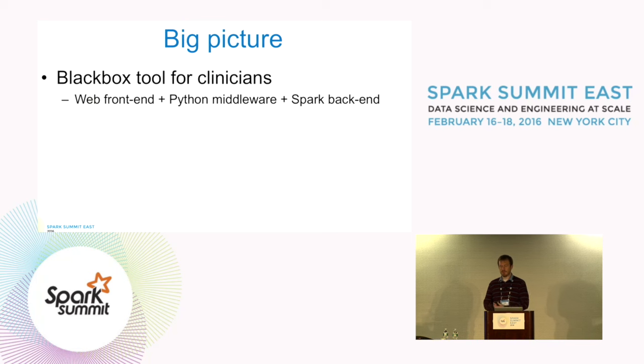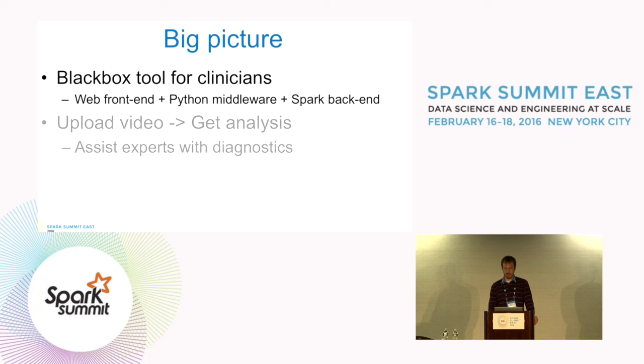And the ultimate goal is we want to create a black box tool for clinicians. There are lots of clinicians out there who would love this sort of information, but don't care to know anything about Spark or distributed machine learning or autoregressive models. And so we're working on, I showed you screenshots of a web front end with the Python middleware and a Spark batch processing backend.